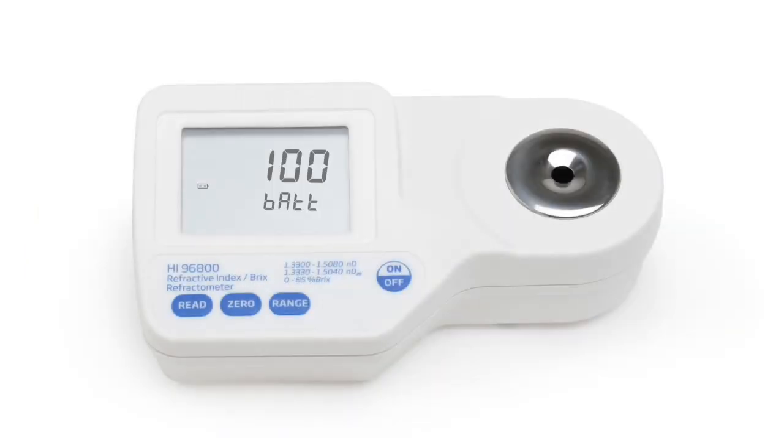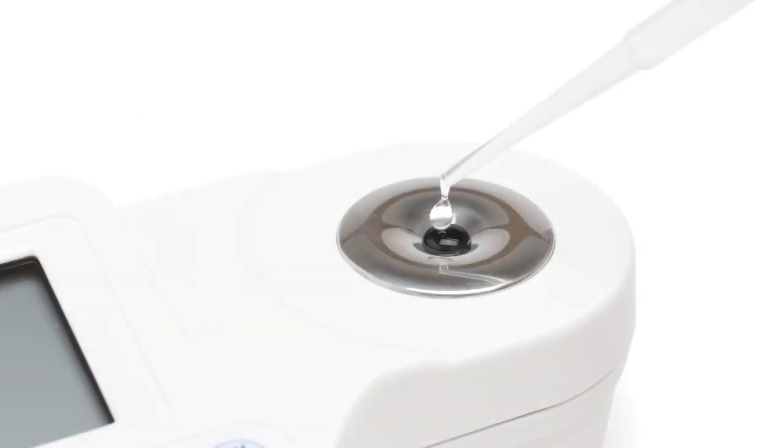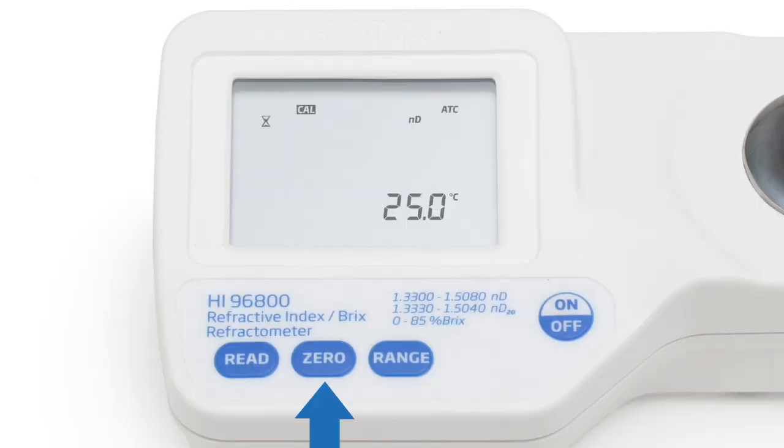When the meter is first turned on, the screen displays the remaining battery life as a percentage. The display will then show four dashes indicating that it is ready for calibration. Calibration is straightforward and only takes a few seconds — using a pipette, a small amount of distilled or deionized water is placed on the sample well, the zero key is pressed, and then zero is displayed to indicate the meter is ready to perform a measurement.